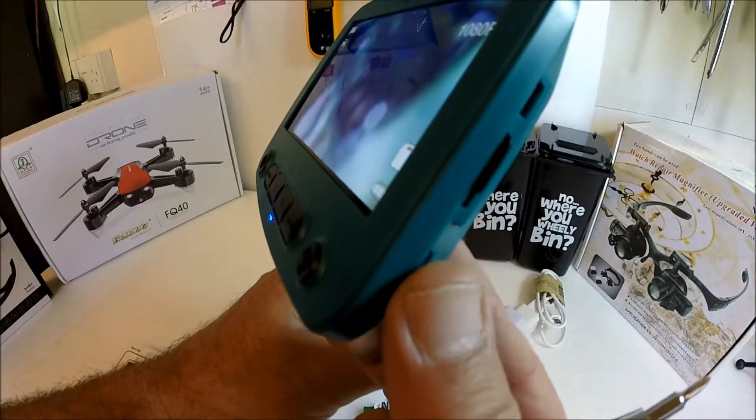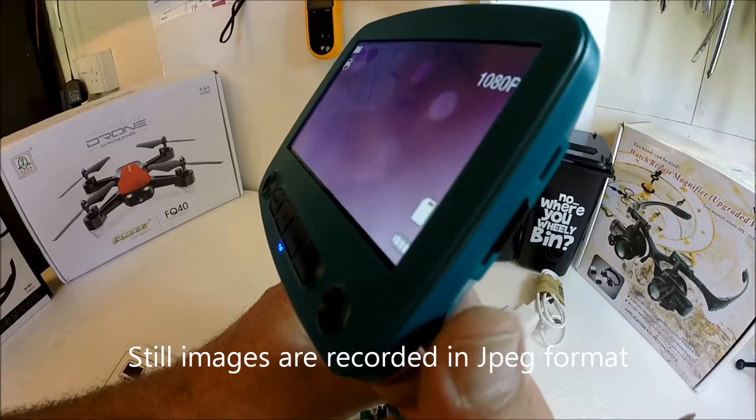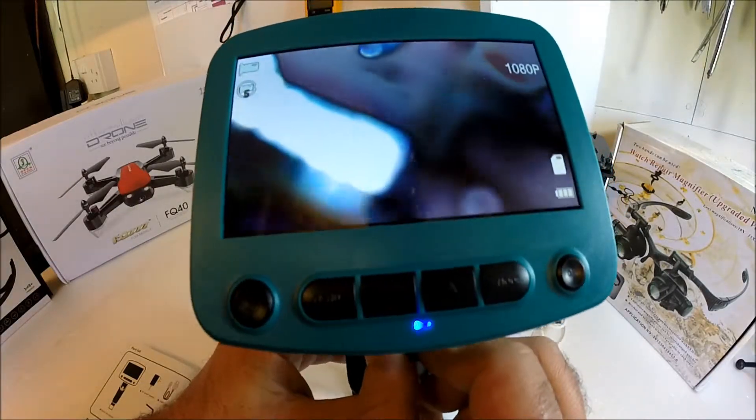This rotation switch here is for your amount of light that you wish to use. This rotation switch here is for your focus.